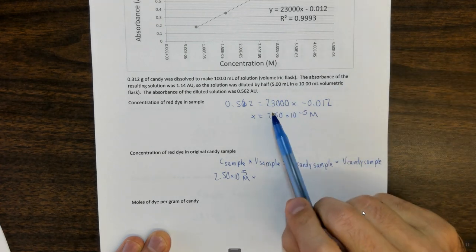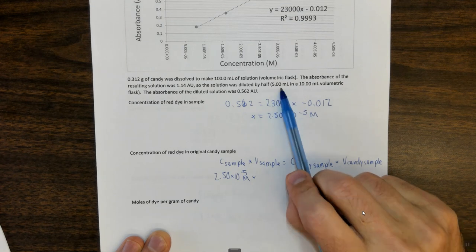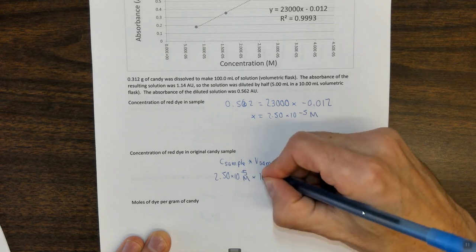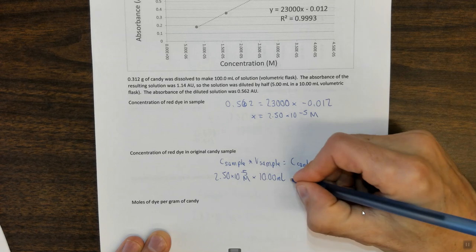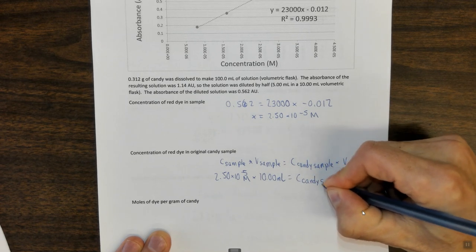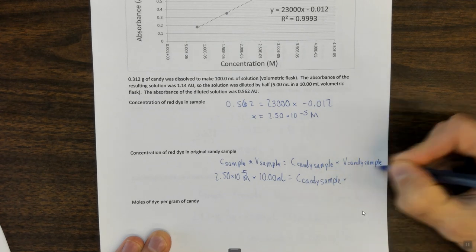Well, the volume that I used of the original sample was 5 milliliters, but I diluted it to a total volume of 10 milliliters. So that was the volume of the whole sample. The concentration of the original candy sample is a thing I don't know. That's my x. Times the volume of the candy sample.